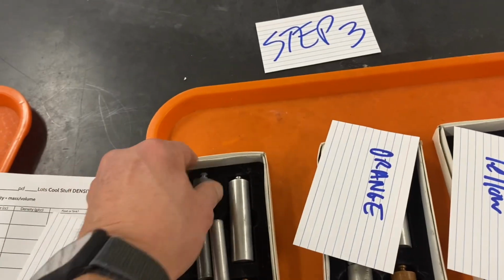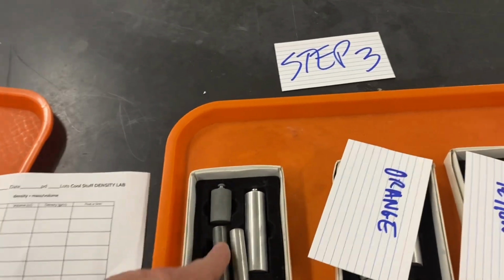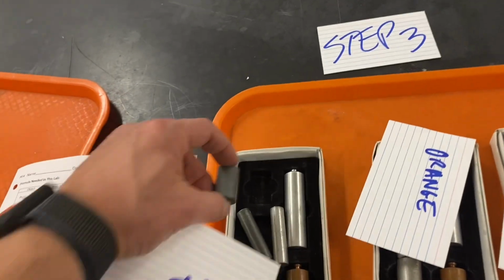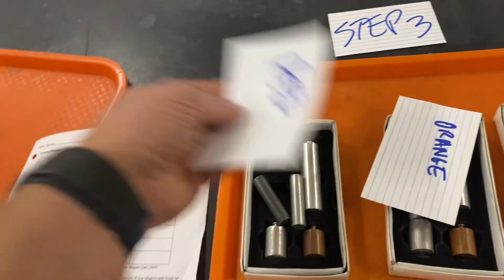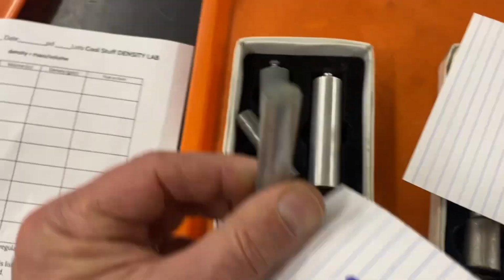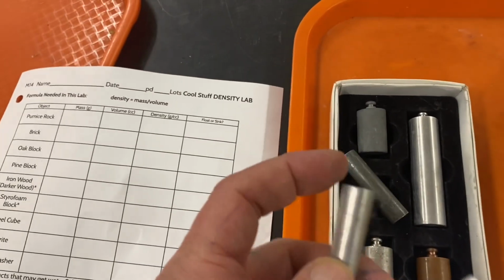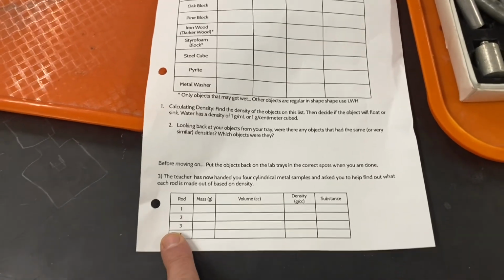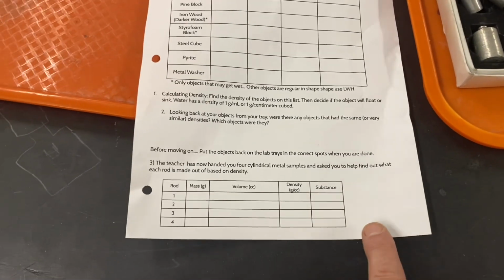They're not numbered, so you're going to have to somehow describe one that you're going to call cylinder 1. First, let's say you do that one. You'd have to describe what it looks like somewhere, so you could pick it out of the box if you need to find it again. You just pick one, call it cylinder 1, and then describe it somewhere on that paper so you could go back in the box and say, oh yeah, this one was cylinder 1. Just so you can find it again, because you want to have some kind of record. There's not a lot of space. You might have to use this space over here.